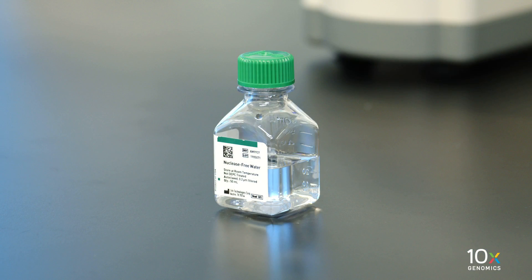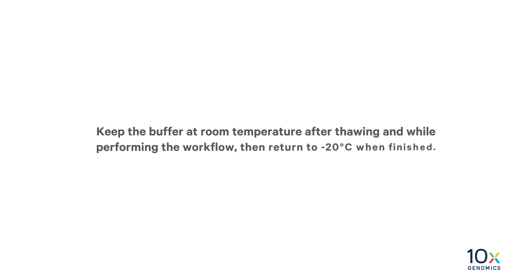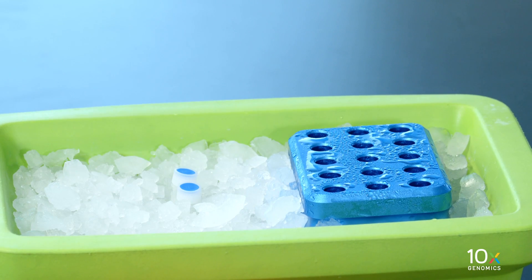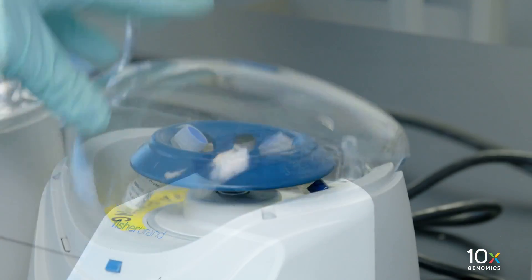Next, we will prepare the probe hybridization mix. We have nuclease-free water and FFPE High Buffer. Thaw at room temperature. If precipitate persists, heat at 37 degrees Celsius until dissolved. Avoid vortexing to prevent bubble formation. Pipette mix 10 times. Keep the buffer at room temperature after thawing and while performing the workflow, then return to minus 20 degrees Celsius when finished. We have Human WT Probes V2 RHS and Human WT Probes V2 LHS; thaw on ice. Mouse WT Probes RHS and Mouse WT Probes LHS are also available. Please refer to the user guide for details. Vortex and centrifuge briefly.